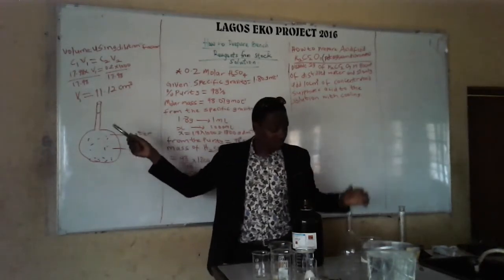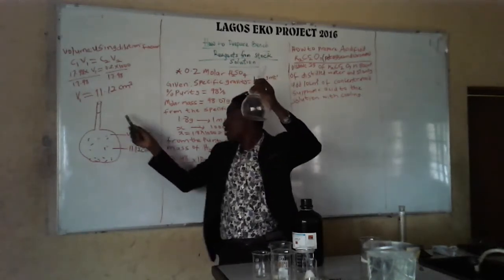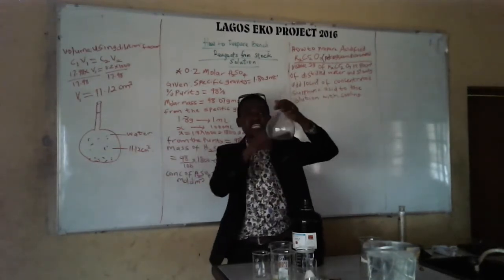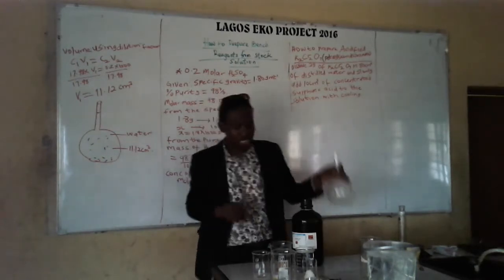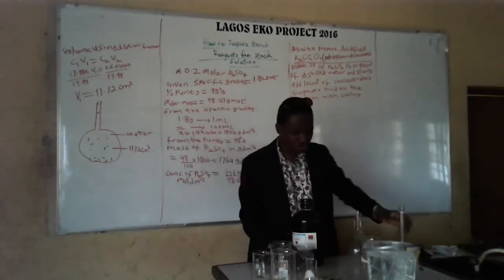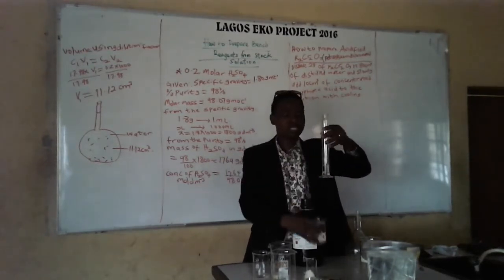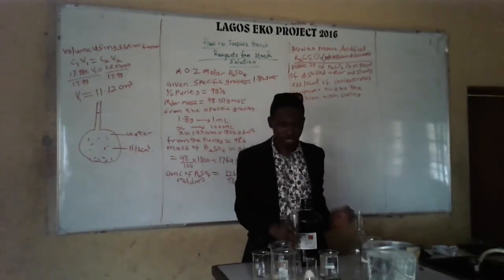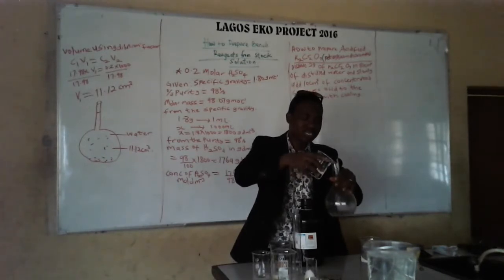Now, what is the implication? To prepare this standard solution, I have to measure 11.12 cm³ from the stock solution. An important safety note: you cannot add water to acid — you have to add acid to water. So first, add a little water to the volumetric flask.